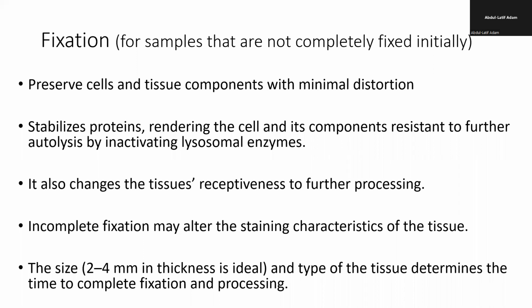And these enzymes and proteins and other things depend on the nutrients in the blood. And so after taking the tissue out of the body, they lose contact. So they are not able to get the nutrients that they need from the blood. And so they tend to feed on the cells. They feed on the cells and they cause what?